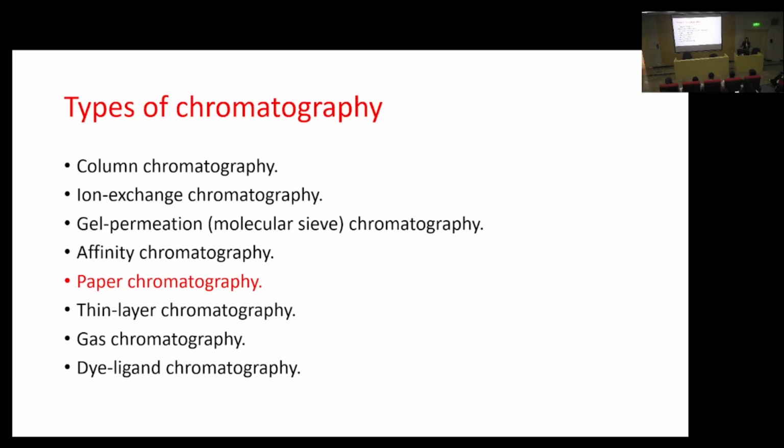When you go downstairs, you're going to conduct paper chromatography, and do that exercise. Please ask yourself, in this experiment, what is the mobile phase? What is the stationary phase? What are those two factors that determine how much separation will happen, if it happens? These concepts are very important to bear in mind.